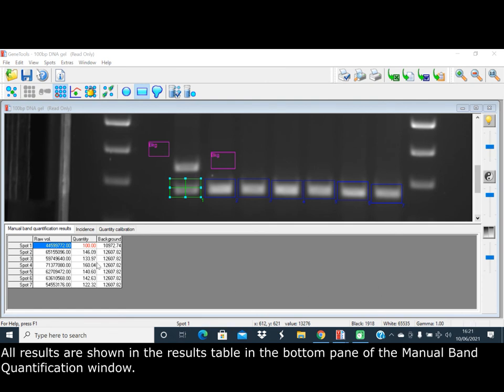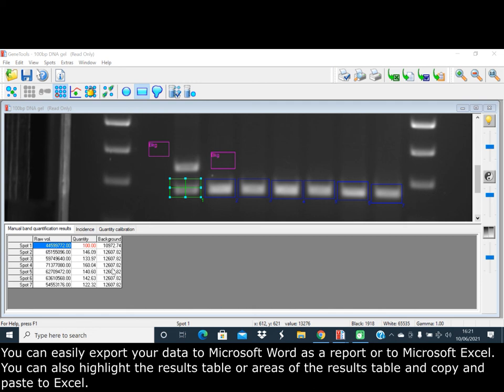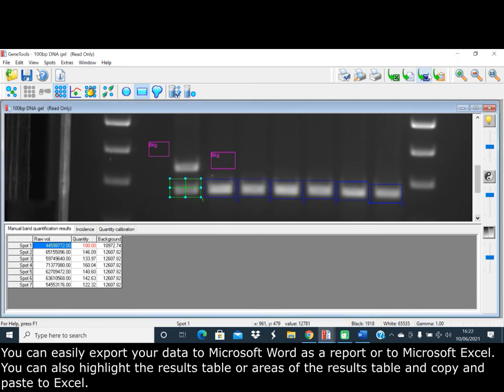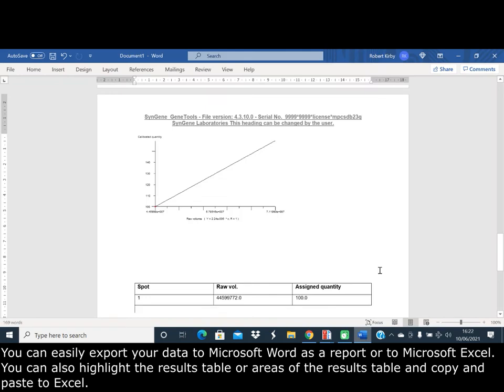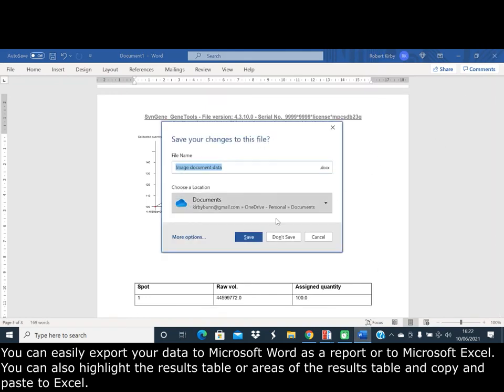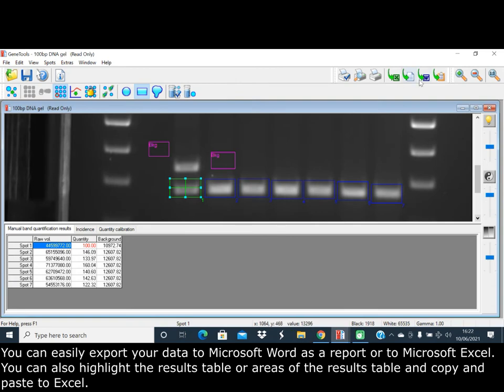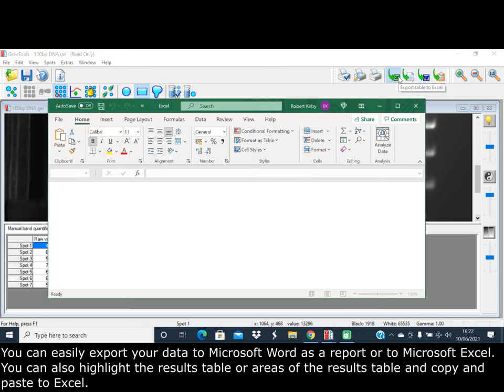All results are shown in the results table in the bottom pane of the manual band quantification window. You can easily export your data to Microsoft Word as a report or to Microsoft Excel.